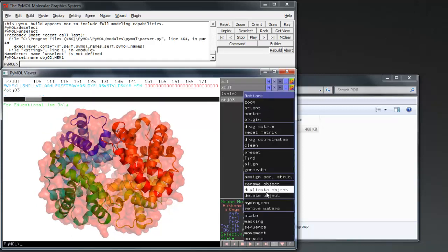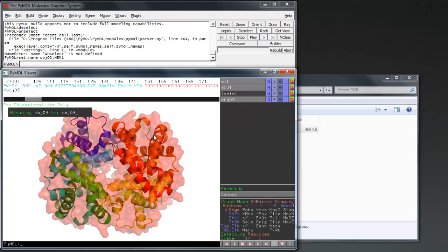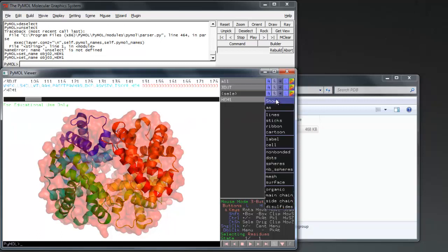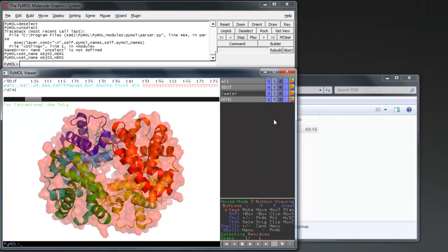The PDB entry for your protein might contain papers that explore important residues within the protein. For instance in my protein there are 4 heme groups responsible for carrying oxygen, which I am going to display.